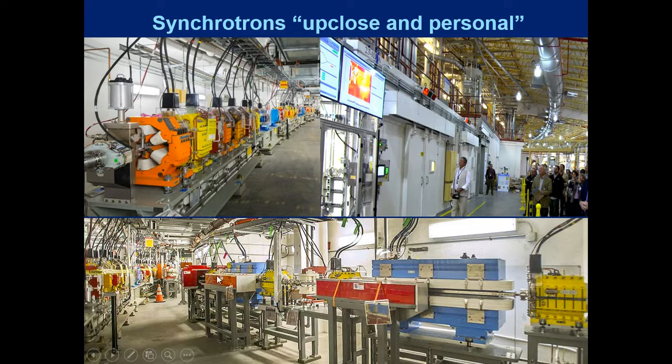You can also see here in this bottom picture, these are magnets that are set up slightly differently than the ones in the upper left. These are long magnets that sit on the top and the bottom of the tube, and there are also magnets on the sides, and those help bend the electrons as they're moving through. Some of these magnets have some cool names. They're called wigglers and undulators, which literally force the electrons to move within their space and emit energy.